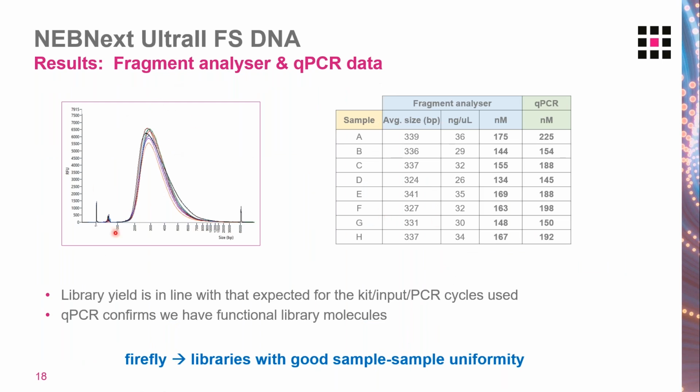So this is the same data here on the left, and I've just shown the breakdown of the fragment analyzer output. We're also showing you the concentration from the fragment analyzer compared to the qPCR that we performed on each of these samples as well.